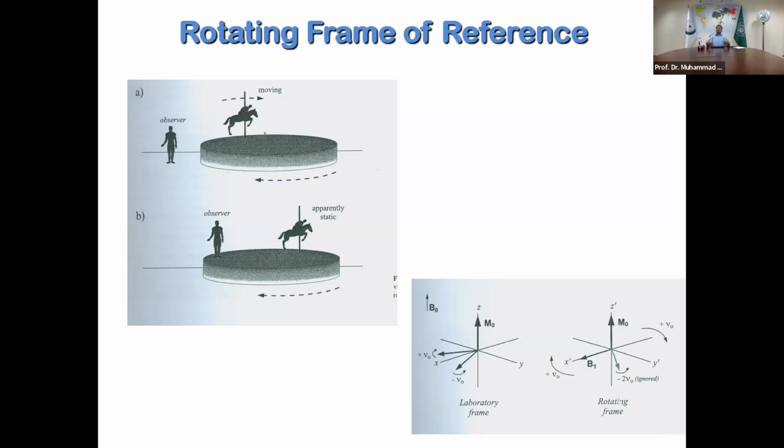There are so many concepts that you need to understand in order to understand NMR spectroscopy. Life was very easy when there was radio frequency absorption, continuous wave NMR. But all modern NMR experiments can only be explained by vectors, their position on the XY plane, pulses which differentiate them, and then a detector which records the FID at different time intervals.